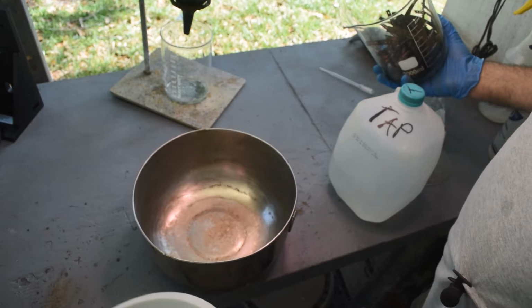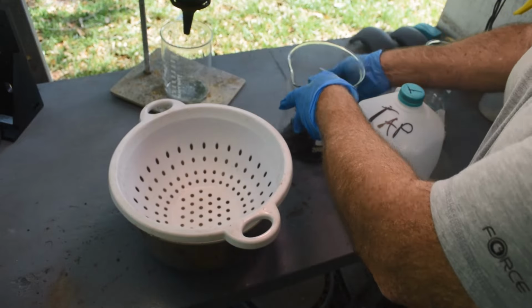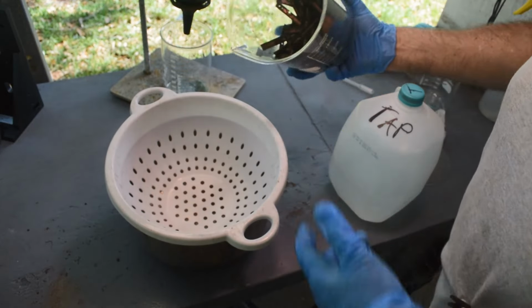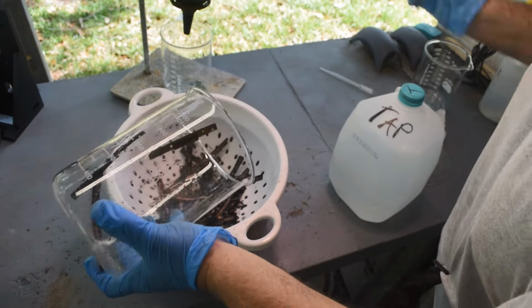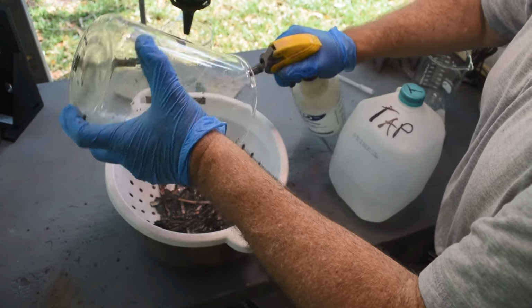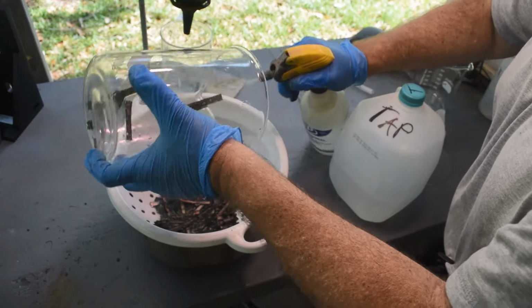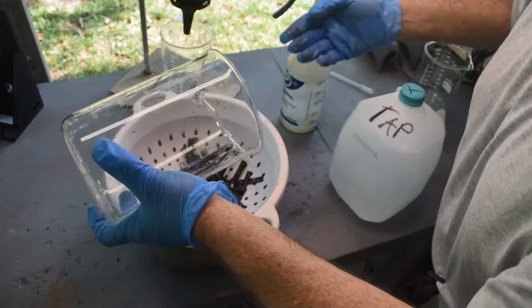I've just got a bowl, a colander. Probably this would work better with a bigger bowl. Biggest one I can find right now. Dump these in here. Let me wash everything out of the beaker. And at this point, I am just using tap water. I am not concerned about chlorine anymore since I've gotten all of the blue liquid off of this stuff.